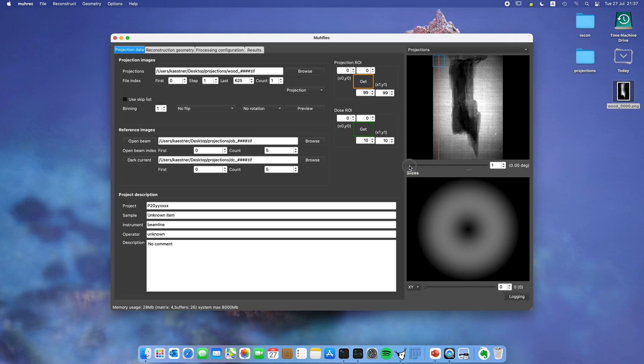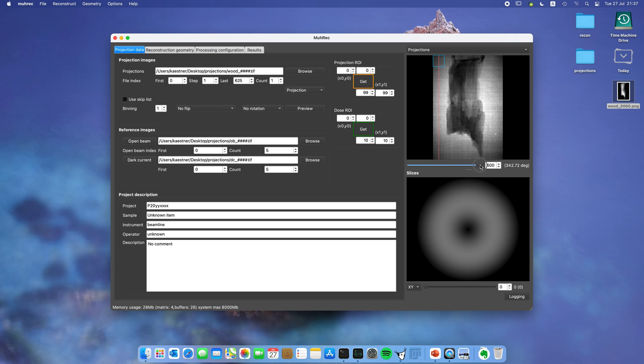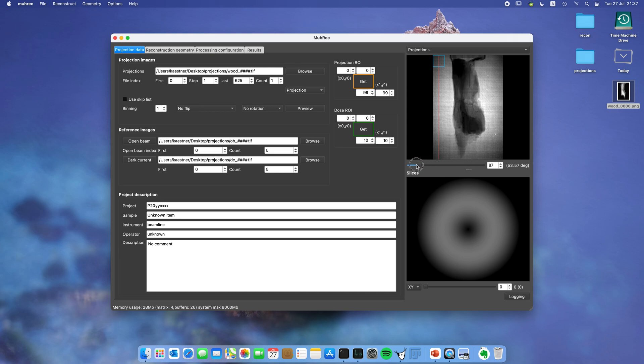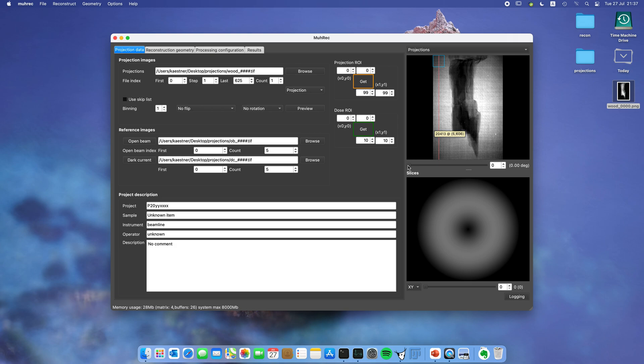Now we can take this slider and rotate the image. You can see that it's a pretty wide thing, but this is what we're going to work with now. It's actually very helpful to have it in this wide view.